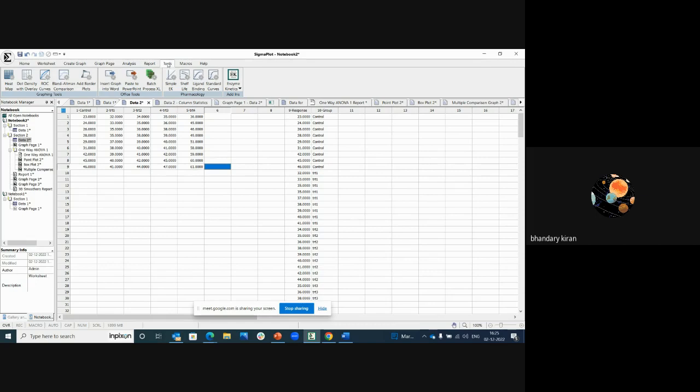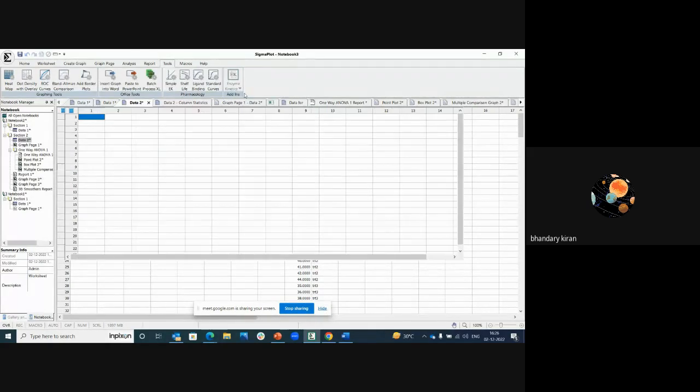In the tools menu, we can see the enzyme kinetic module also. Under the enzyme kinetic module, you can fit multiple equations simultaneously. In a global curve fitting wizard, you can fit multiple data simultaneously by a single equation. In the enzyme kinetic wizard module, you can fit multiple equations simultaneously to the single data. So I'm going to explain this enzyme kinetic wizard with the help of one sample data.